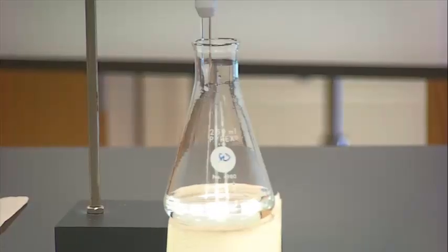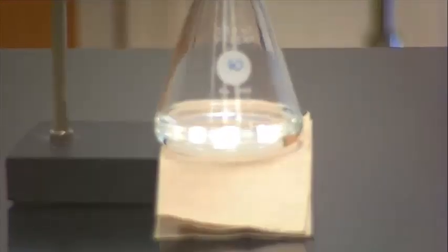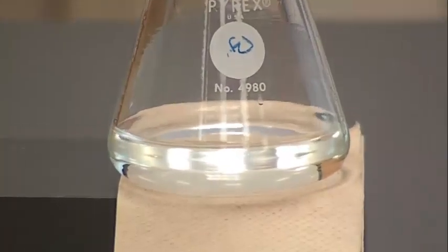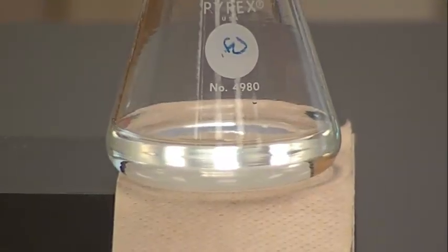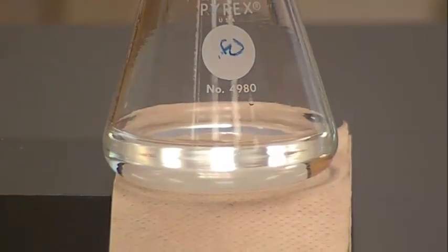I think that represents the total amount of thiosulfate that I dispensed reacting with all of the molecular iodine. The starch color has disappeared. And now I'll just read off the burette. Since I started off at 0.00, all I can do is just go all the way down and read my volume. You want to do this twice.